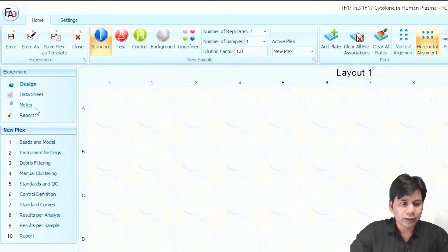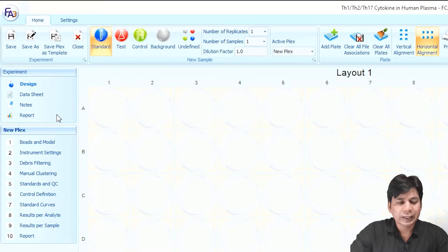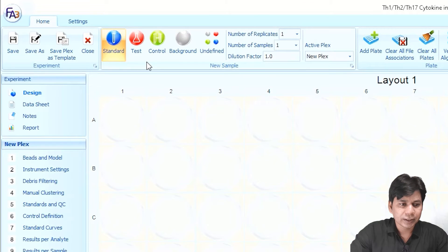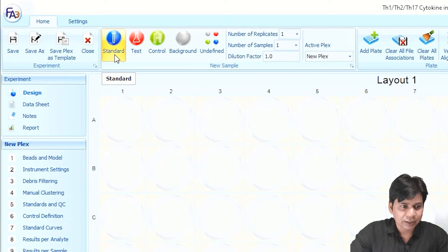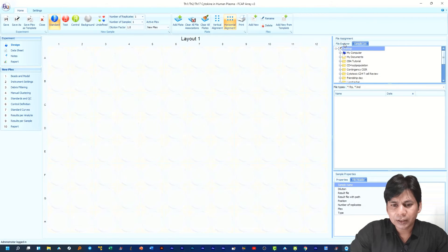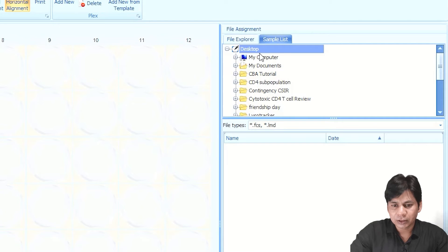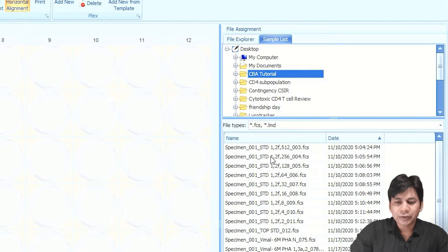If you want to add a note you can click on 'Notes.' The report section will be used after analyzing the data. First you have to select your sample type — standard, test sample — and assign it in the layout. You can see standard, test, control, background, and undefined sample options. In the file explorer you can select the folder or file of your experiment. My file is on the desktop in the CBA tutorial folder, so I am clicking on it and you can see all the files are present here.